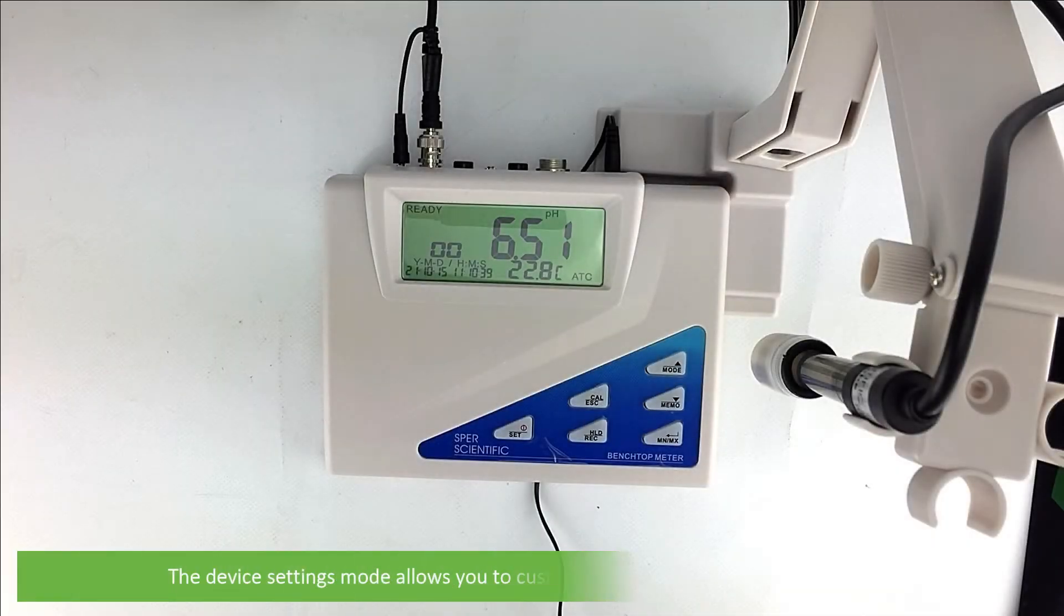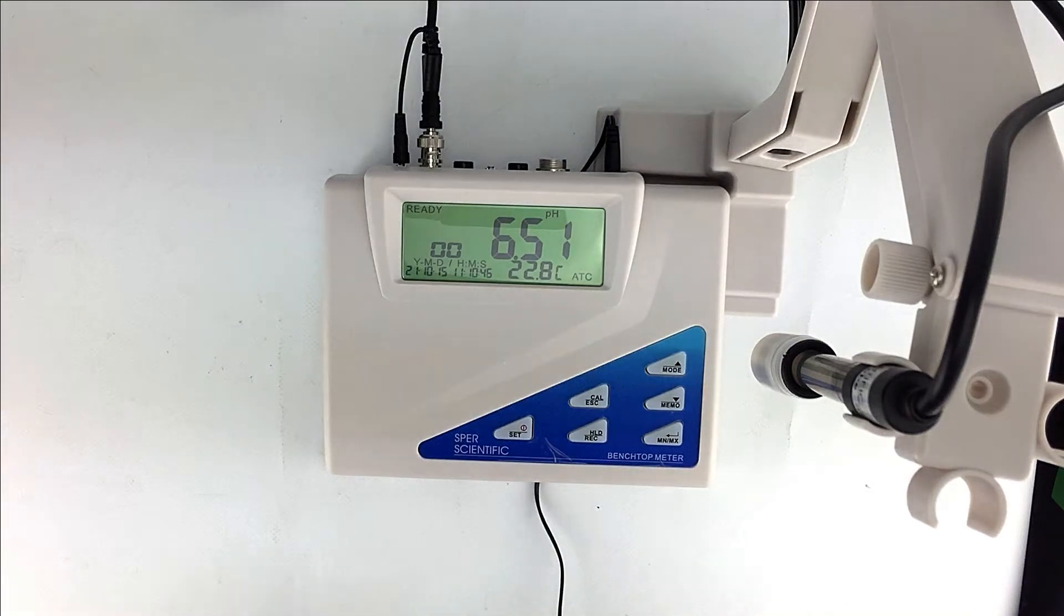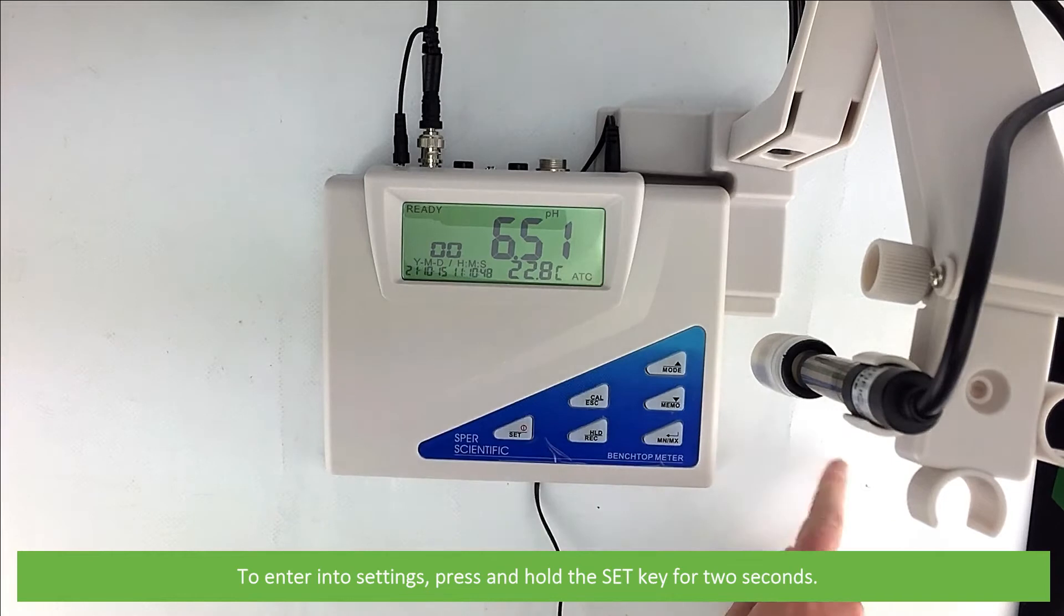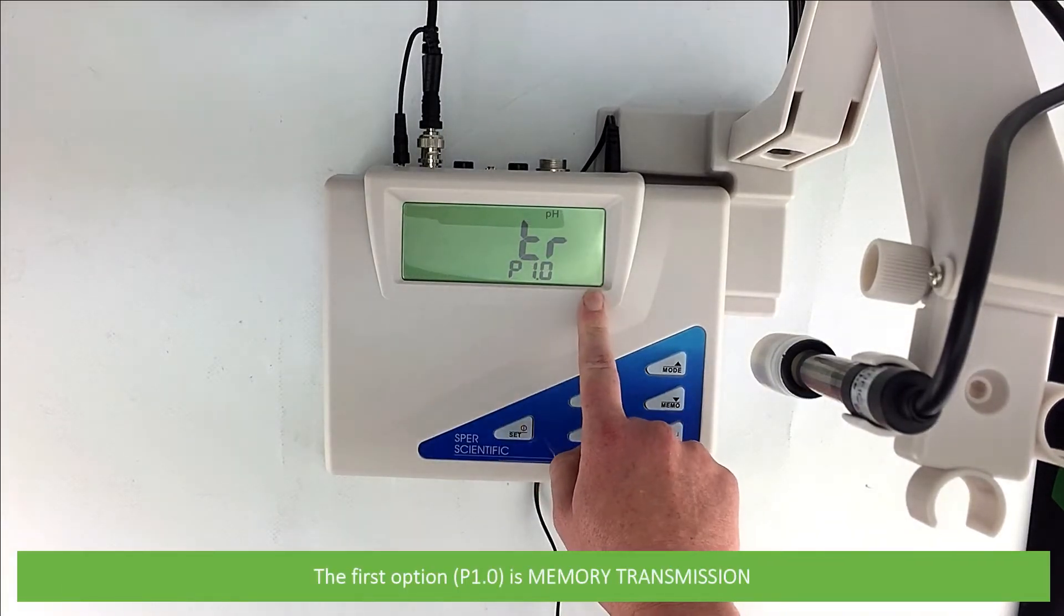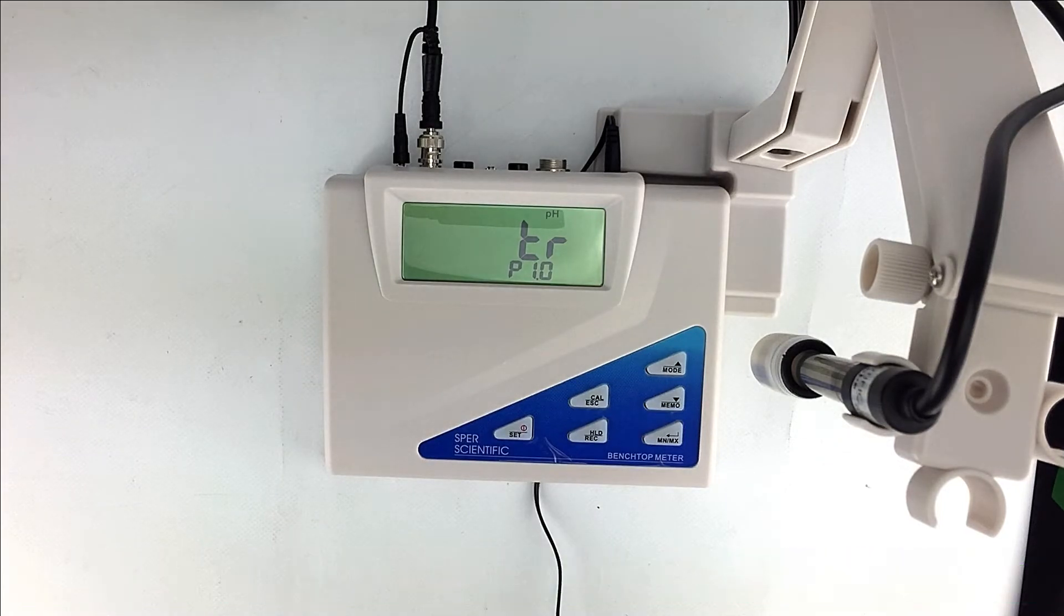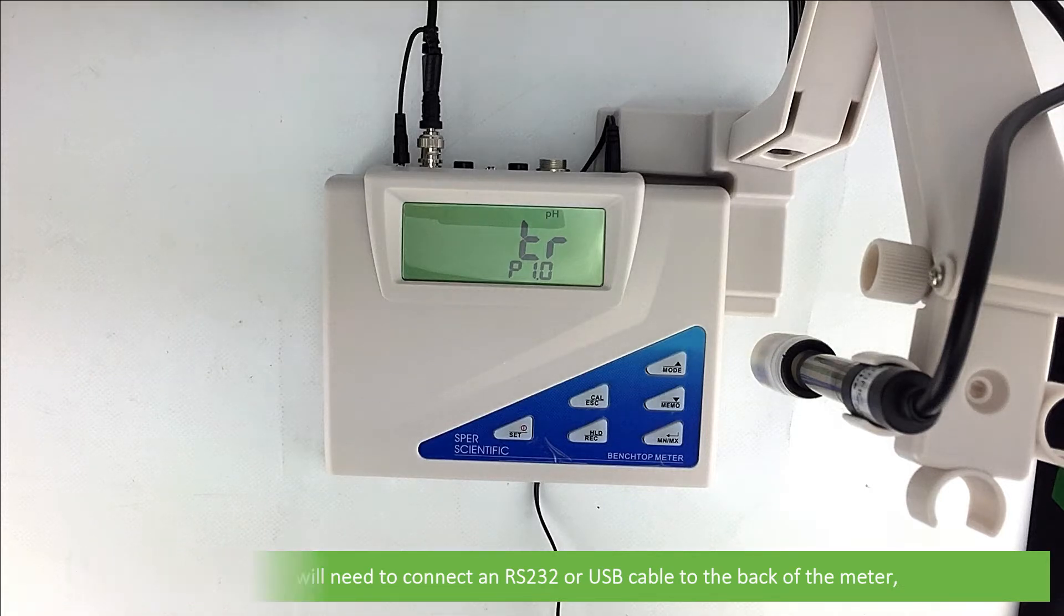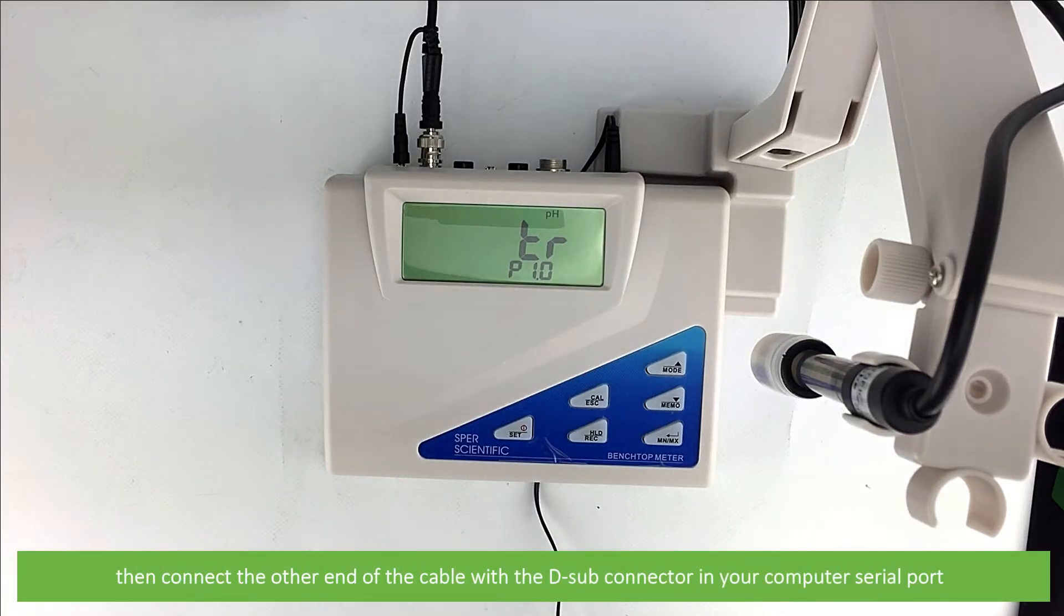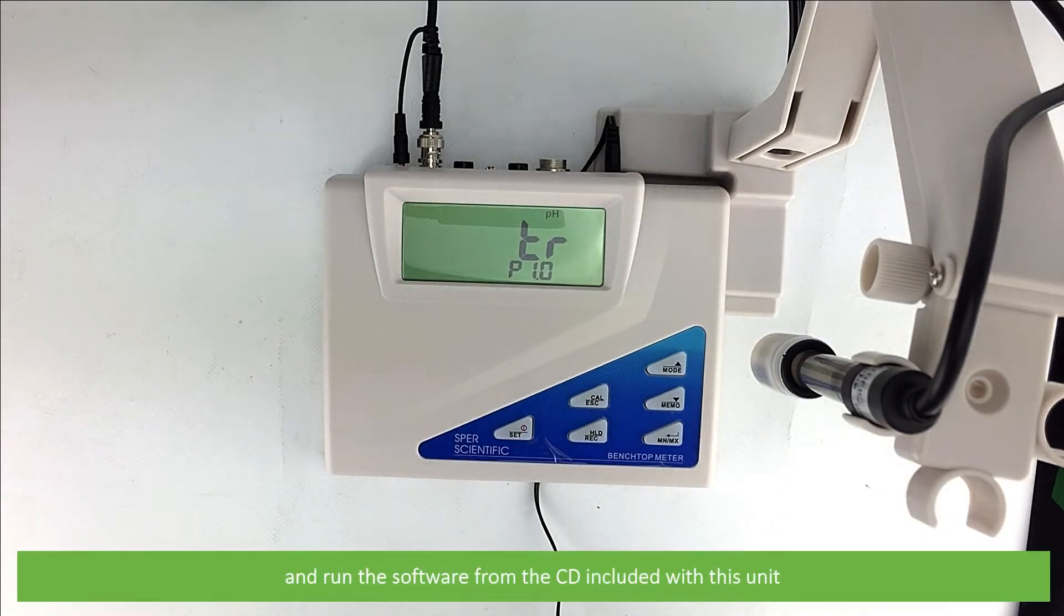The device settings mode allows you to customize the meter preferences and defaults. To enter settings press and hold the set key for two seconds. The first option is memory transmission. This setting allows you to transfer stored data from the meter to a computer. To do this you will need to connect an RS-232 or USB cable to the back of the meter, then connect the other end of the cable with a D sub connector in your computer serial port and run the software from the CD included with this unit.